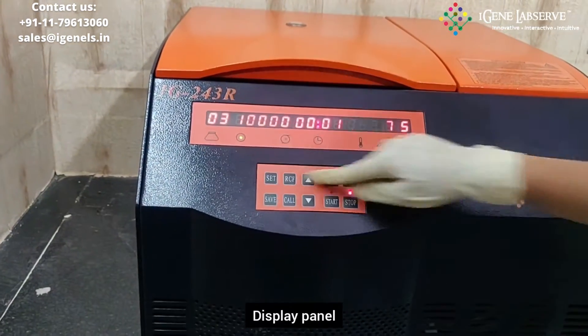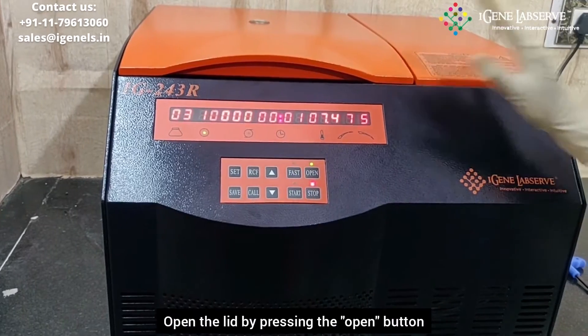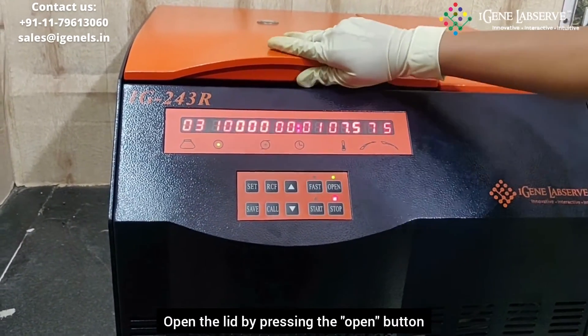This is the main display. This is the controller for the display for setting various parameters. To open the lid, you have to press the open button and the lid opens.